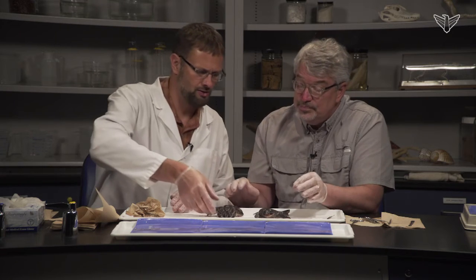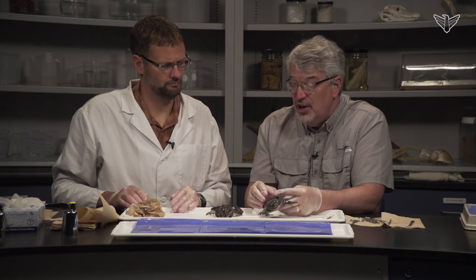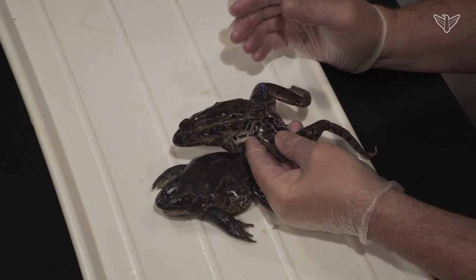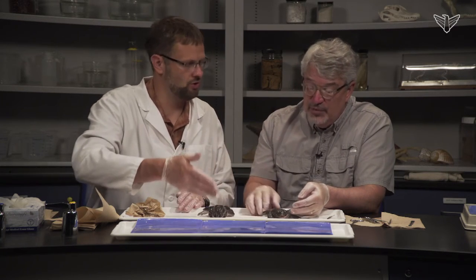Anyway, we should also point out that, like medicines, there's some dye in there. Another choice you have when you get your frogs is whether they're plain uninjected frogs, with just preservatives, or injected. They'll inject the circulatory system with a latex that will color the arteries and veins, using red for the arteries and blue for the veins. If you really want to look at the circulatory system in some detail, then these injected frogs, which of course cost more, are the choice. So we'll probably dissect out a regular one, and then we'll show an example. We'll do some plain and show some examples if you would want to do them.